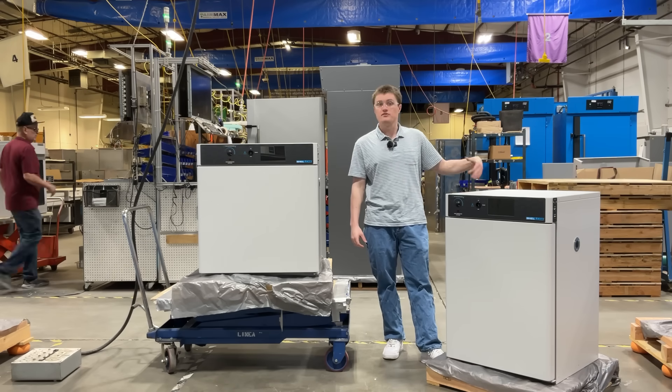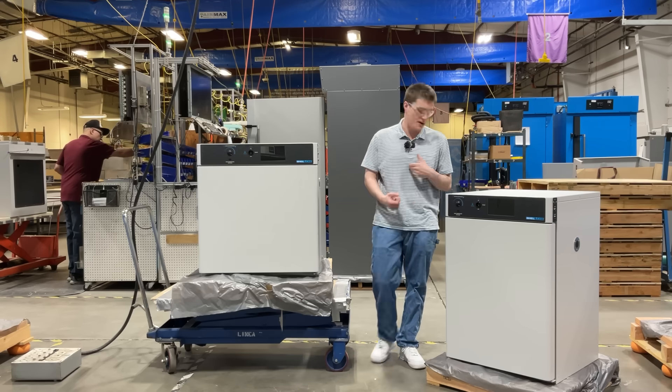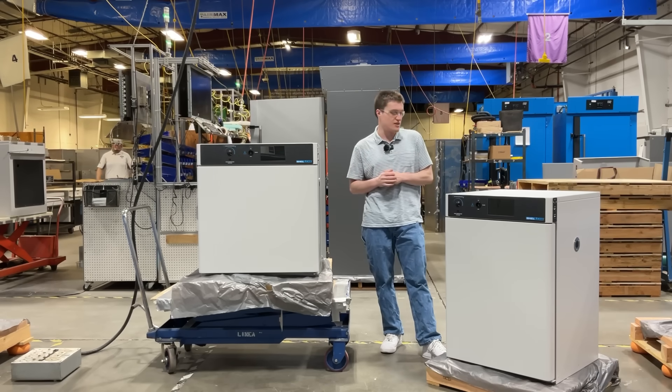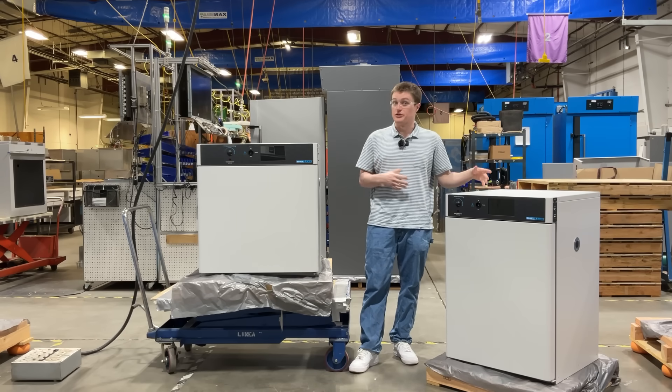Also, on this side of the unit, you will find the externally located fuses, should the user need to replace them at any time, as well as the expansion port. This is where you will connect any 24-volt accessories that you may want to purchase from our website. We also have these listed in our user manuals as well.